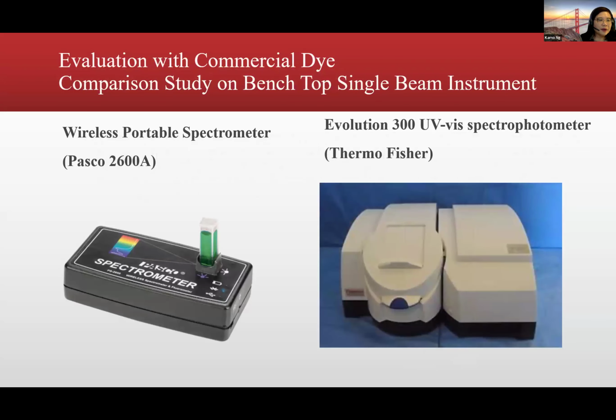So then we compared our performance with this wireless spectrometer with the traditional benchtop UV-Vis instrument.